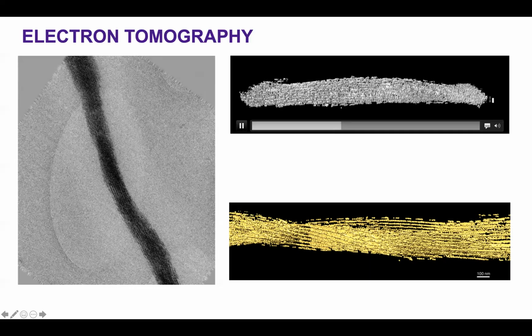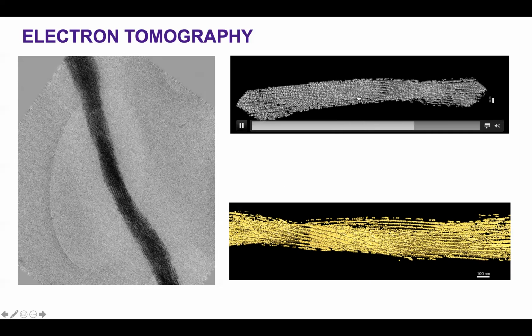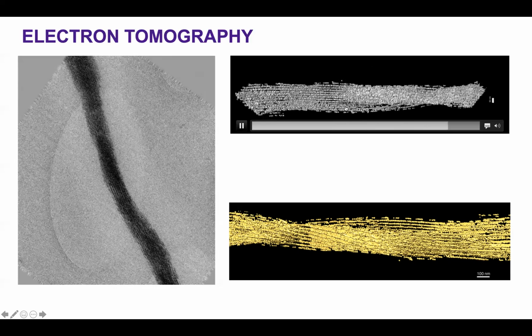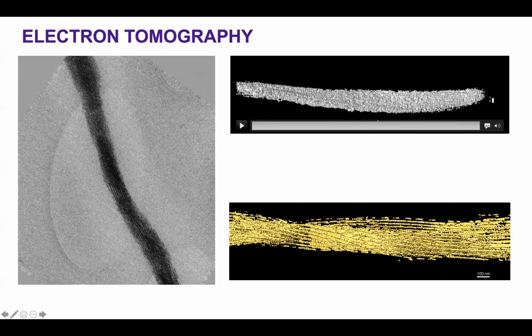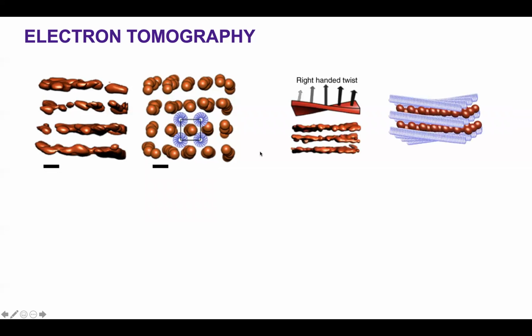But from this, we have individual gold nanoparticles. We can extract the location, orientation, and position of the nanoparticles in three-dimensional coordinates, which can then construct the structure. Now you can see why this forms a square lattice. This shows from the tomography, colored in red for the gold nanoparticles, how they are oriented, and the space between them fits exactly to the diameter of the virus nanoparticle.